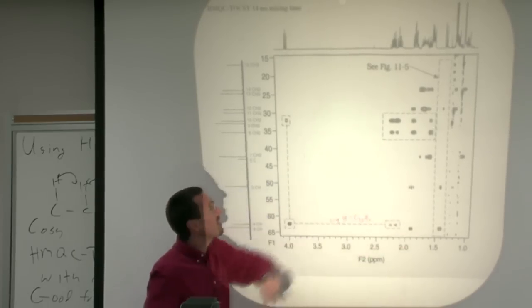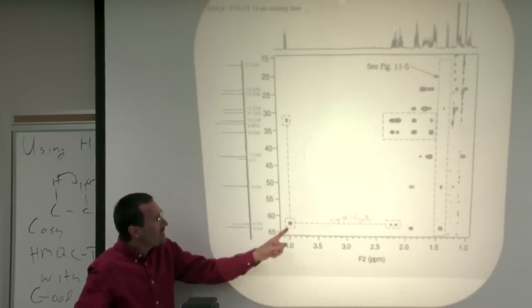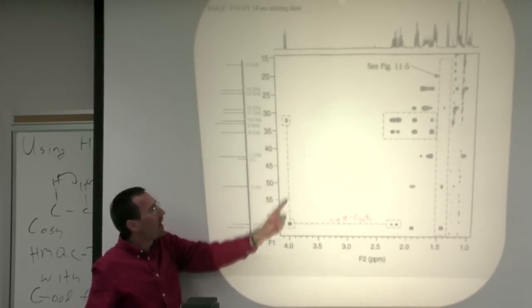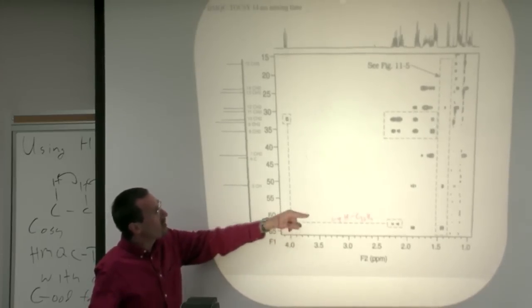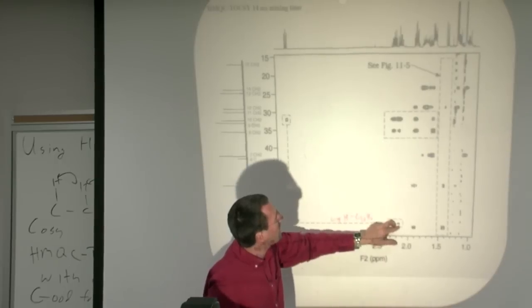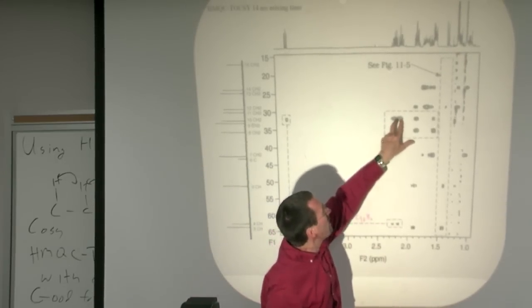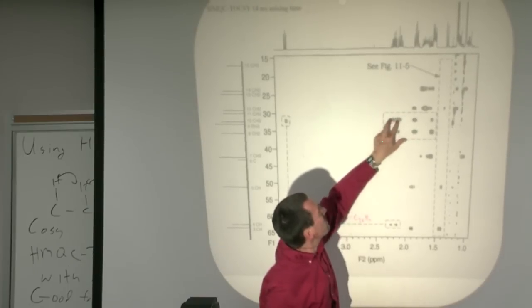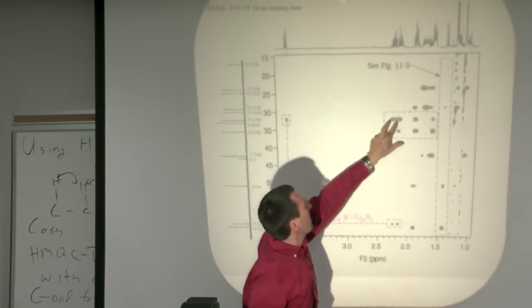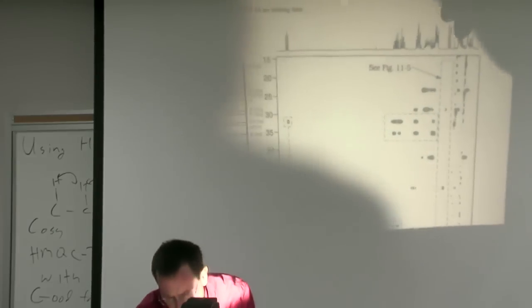I'll show you how to get that even out of this short one. But here's the real power of the technique: you can go up. So here, for example, we're saying, OK, we're fine on 10. But then, for example, as we go here, you see that this is your C10 cross peak, so let me transcribe all of our numbers here.